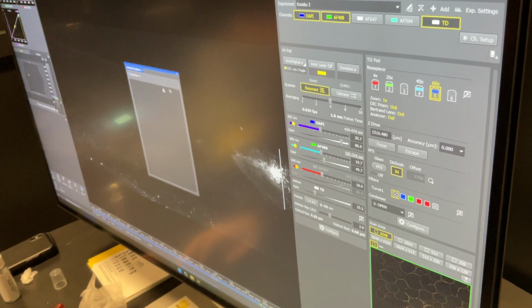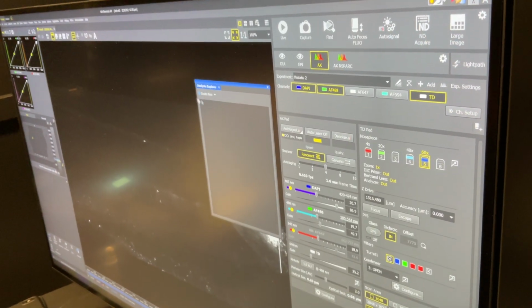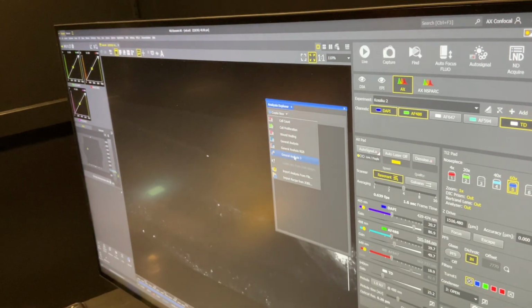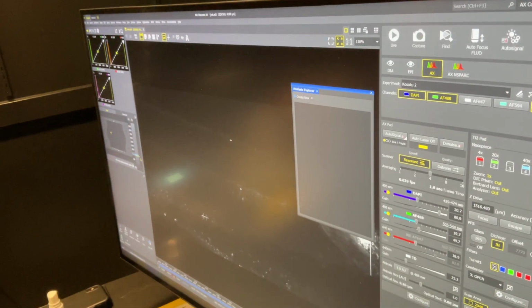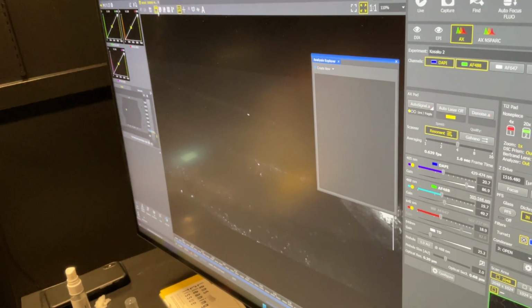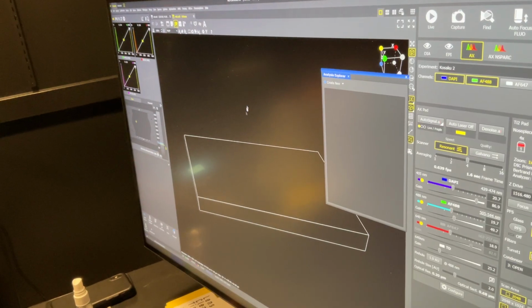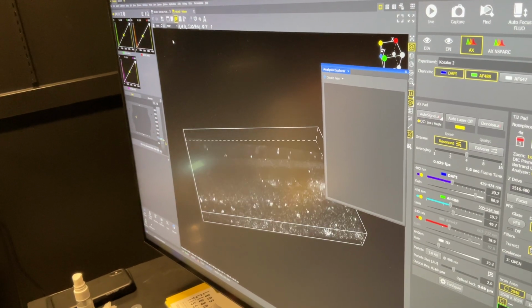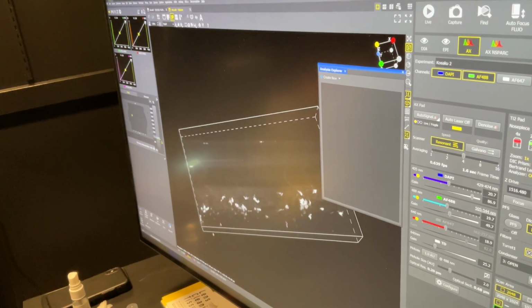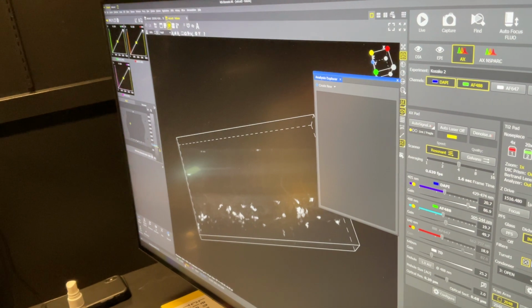This is going to start like any other analysis on here. So we're going to go to the Analysis Explorer. We're going to select Create New, GA3. And I would recommend, if we're doing a three-dimensional analysis here, I am going to turn it into a volume view before we start, because it may glitch out if we try to do it otherwise. That is a place where I have semi-consistently crashed the software.